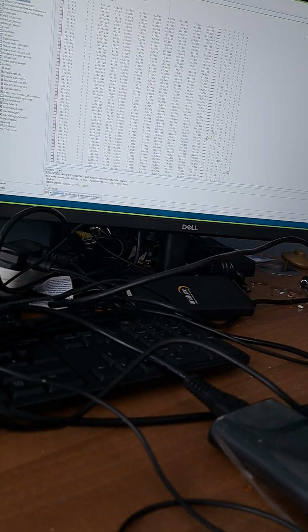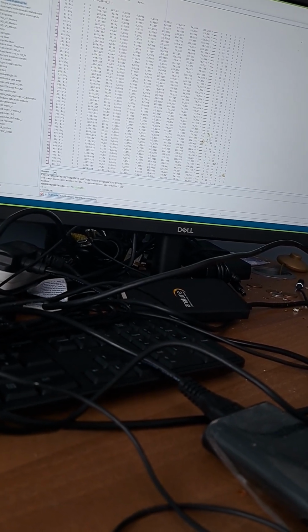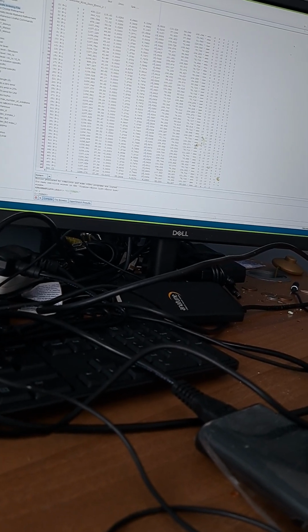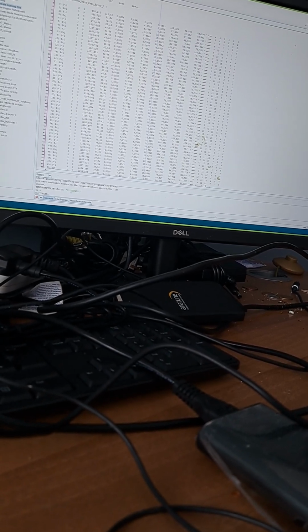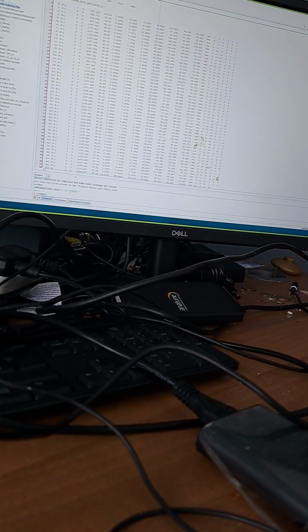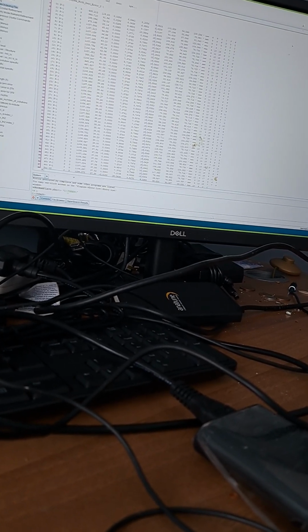Sorry, I might be doing the wrong thing. When you sent the email to make the document, that's why I was doing all this practice, so that I know each and every step of how to do the powder indexing. Yes, okay. I mean, that's fine, but those are documents for yourself, right? We need to make progress on the project.